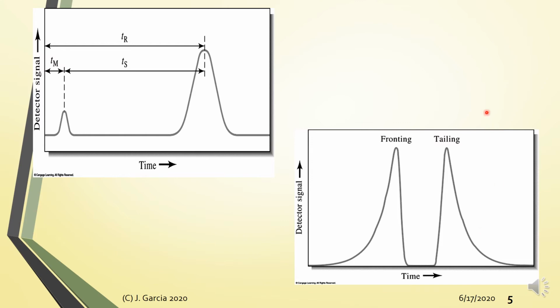All right. So again, ideally you want to have a symmetric peak. In the industry, if you work in, say, pharmaceutical companies, there is what is called the tailing factor, which you can compute using the system, and there is only a maximum level of tailing that is allowed by regulatory bodies. Okay, so you need to be conscious about these asymmetries or deformities in your chromatographic peaks.